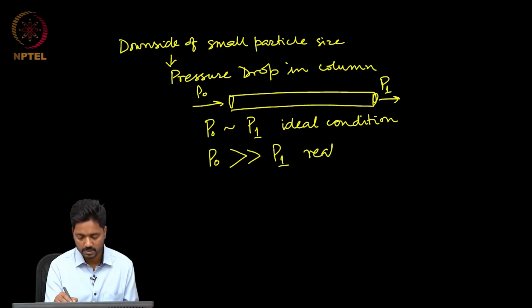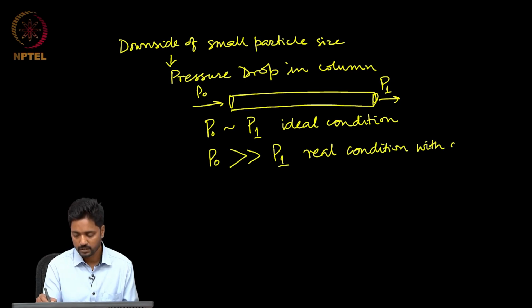So, this becomes a real condition with columns packed with small particles.